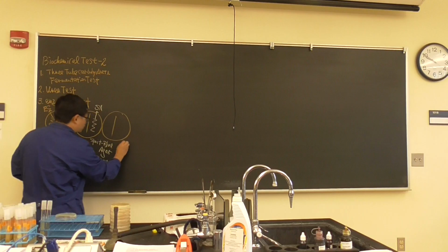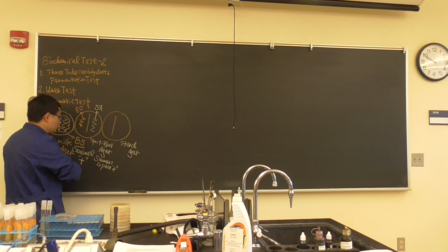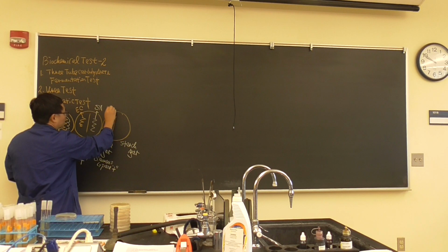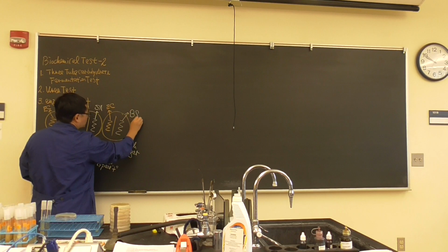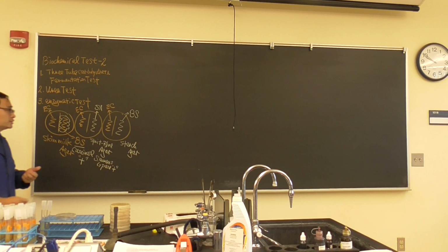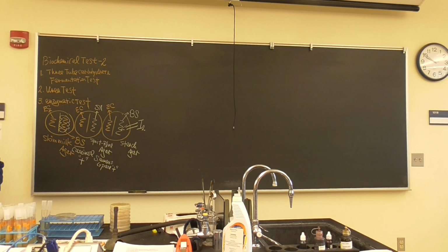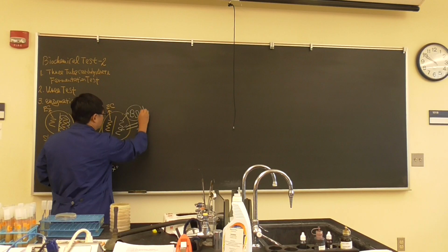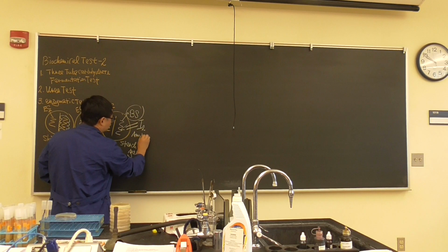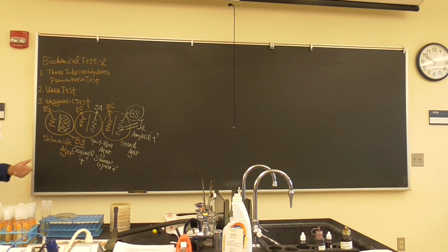And the last one is starch agar. And starch agar, on the left side, you inoculated E. coli. On the right side, you again inoculated the Bacillus subtilis. And I said we have to do a confirmation test, is you have to pour iodine. So which side is positive, which side is negative, depends on whether it turns brownish or not. And you could see clearly later on, Bacillus subtilis is amylase test positive. Okay, you can do a simple test by yourself. So this is what we finished so far.